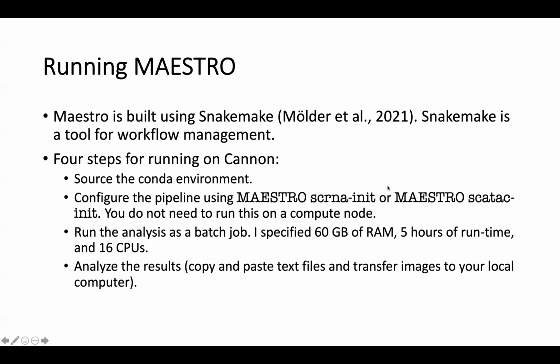Hey, Philip, I have a question regarding the Conda environment. Sure. Is the code provided already included Lisa in it? Because I think I run into issues with that. Yeah, I see. It should. And you're writing an sbatch script?